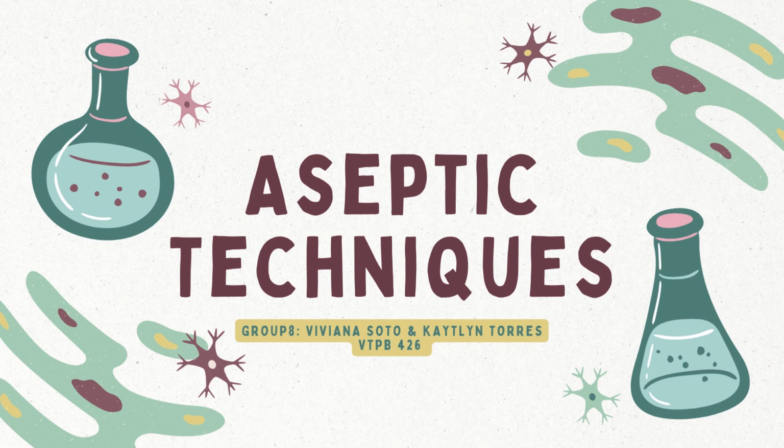Today's lab will be on aseptic techniques. My name is Viviana Soto and my lab partner is Kaytlyn Torres. And we are doing a lab in our VTPB 426 microbiology lab.